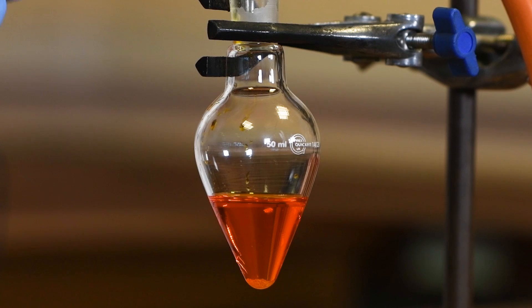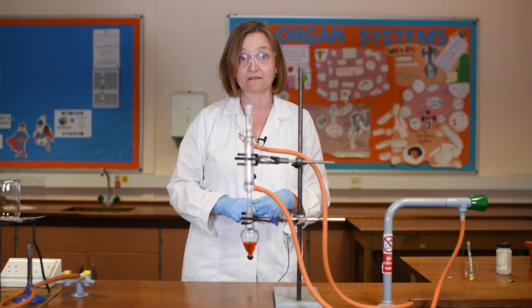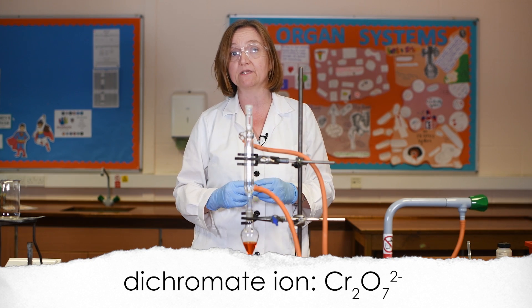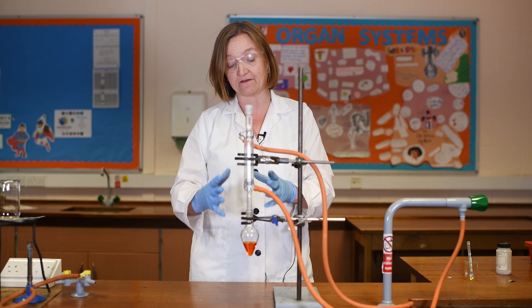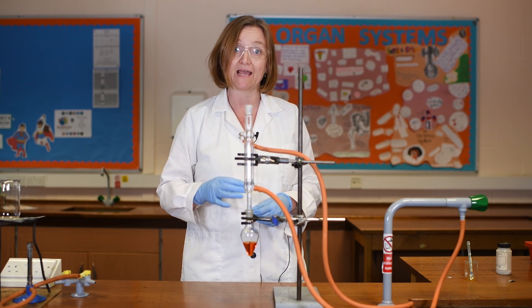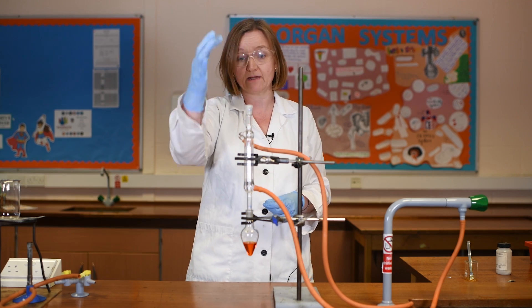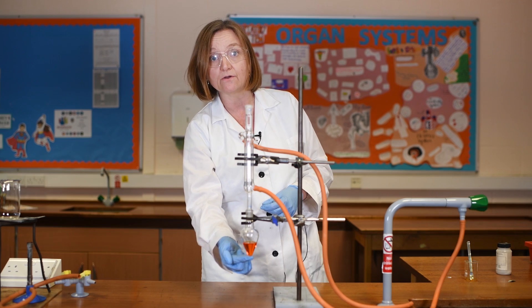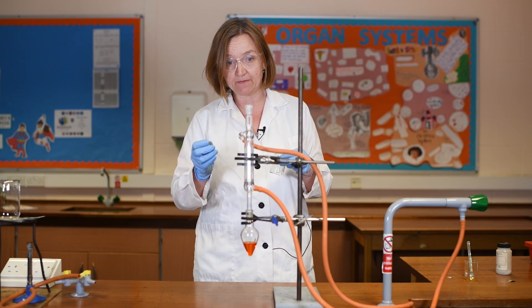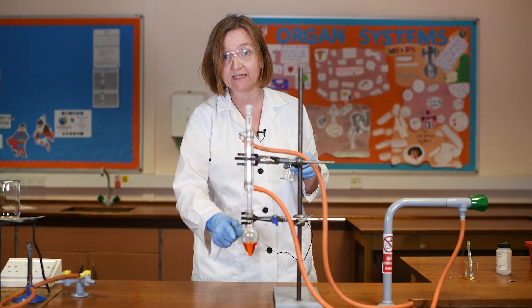My solution is currently bright orange and that's due to the presence of the dichromate ion — that's the Cr₂O₇²⁻ ion — and it's the chromium within that ion that gives us this very distinctive bright orange colour. I'm now going to add one centimetre cubed of ethanol directly down my condenser and into my oxidising agent, using a dropping pipette.